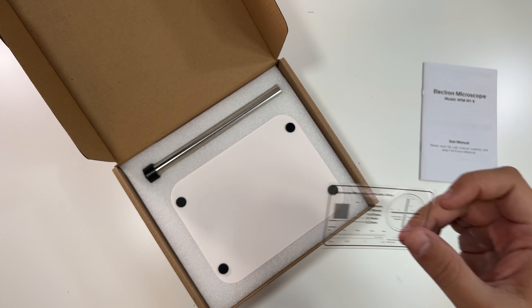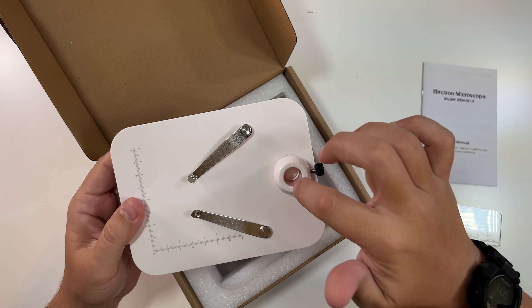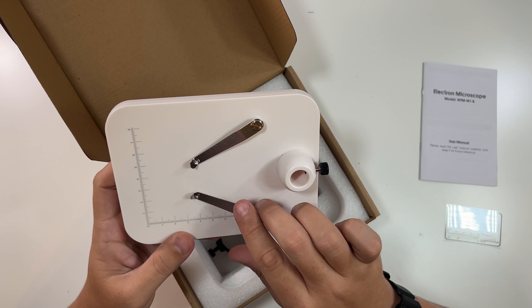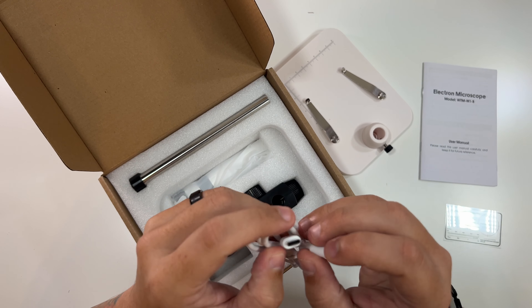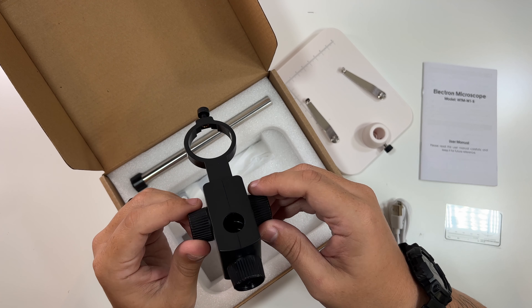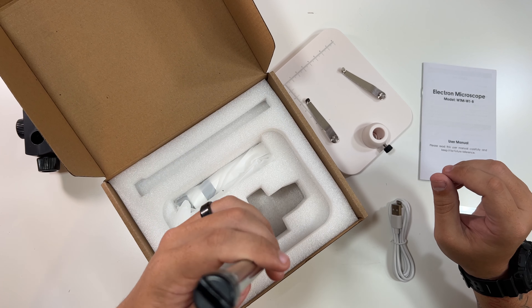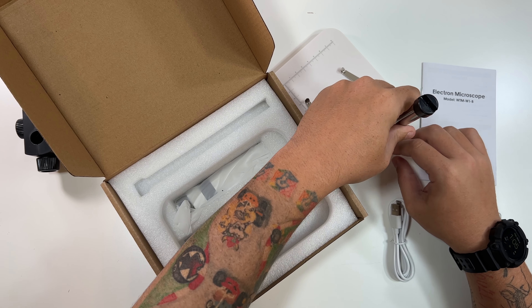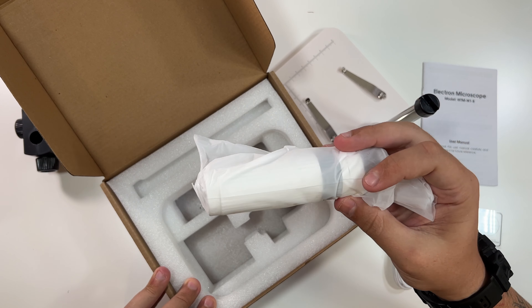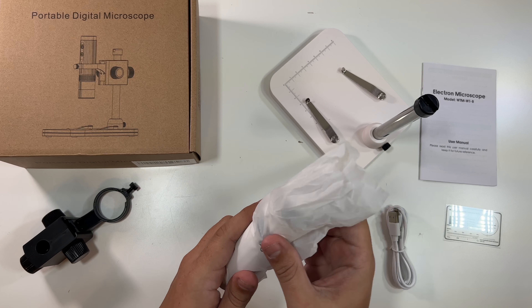Let's open it up. There's a user's manual explaining the device, and a microscope calibration ruler — we'll hold onto that. Then we get to the microscope itself. This looks to be the main stand; one part goes in here to hold the pole and support the microscope. They also include a nice USB Type-C cable, and there's another piece that goes on top somehow.